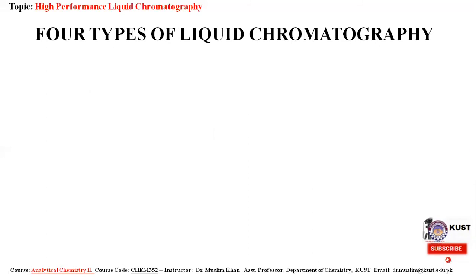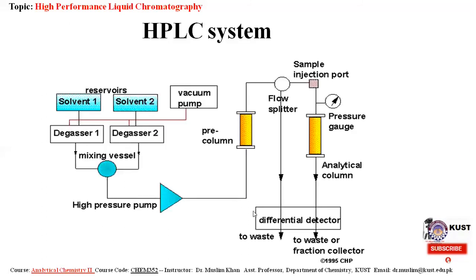So basically, the chromatography of this HPLC system is here on the column, because the column material decides how these different components are separated, how well these components are separated from each other. So what is the chromatography? We discussed different types of chromatography in our last lecture. In this column, there are also different types of chromatography.